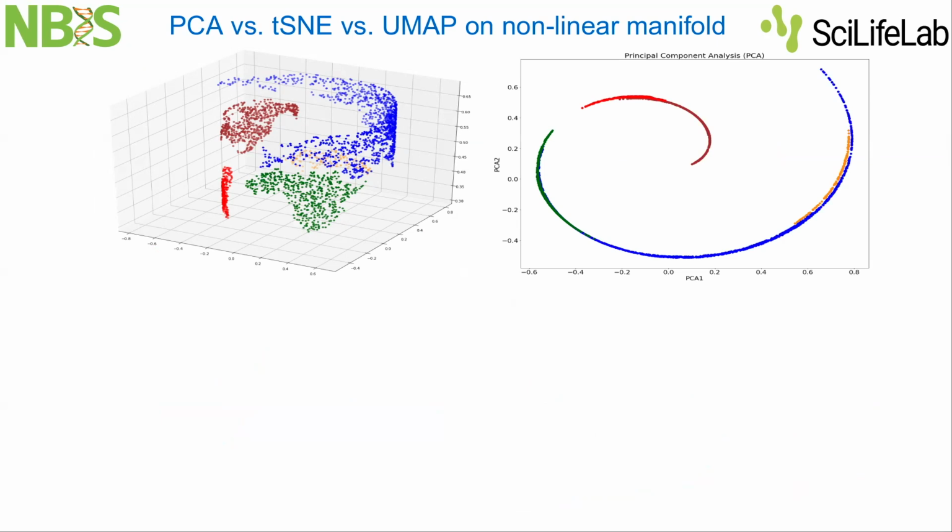So obviously, PCA might fail for some complex data sets. This is what people commonly refer to as nonlinearity, when you introduce this complex structure in your data. Then PCA might not be optimal for resolving the distances between the continents.